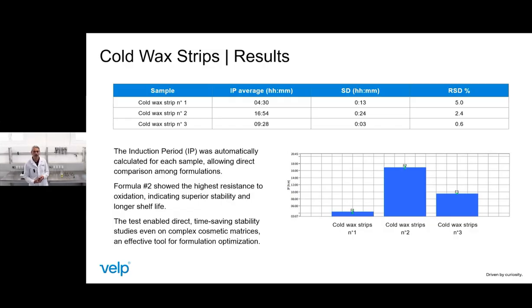This indicates a longer time before the oxidation starts to occur for formulation number 2. This higher resistance to oxidation indicates a superior stability and a longer shelf life for this formulation.